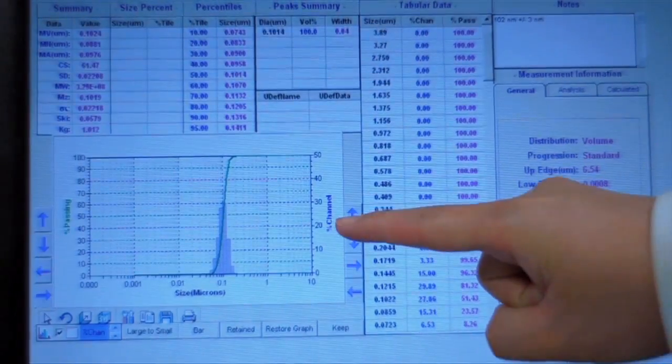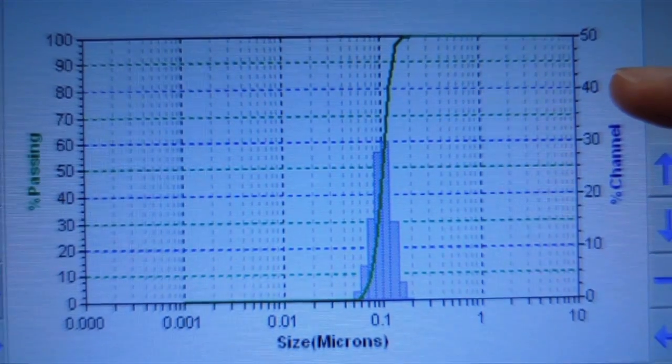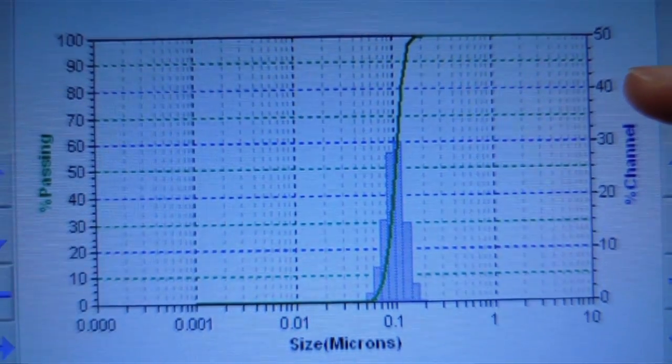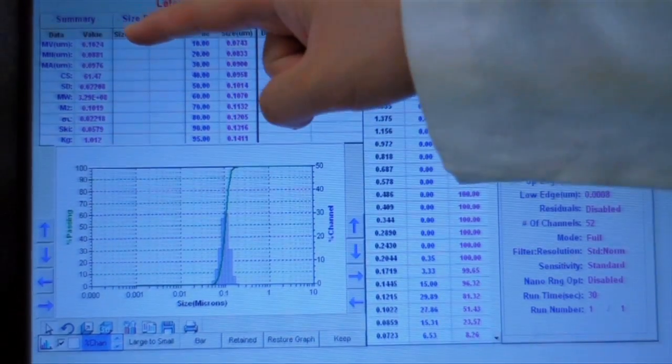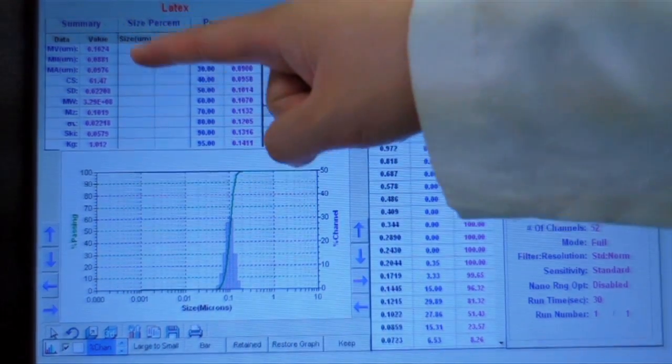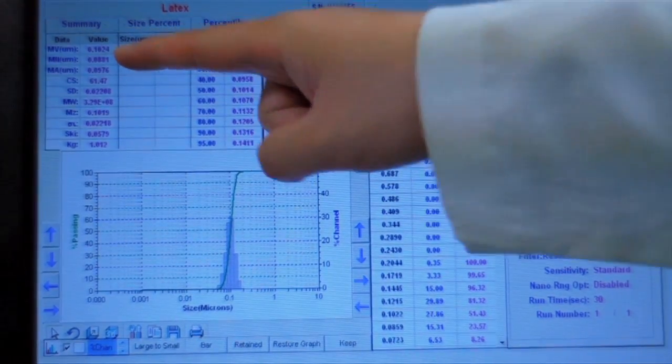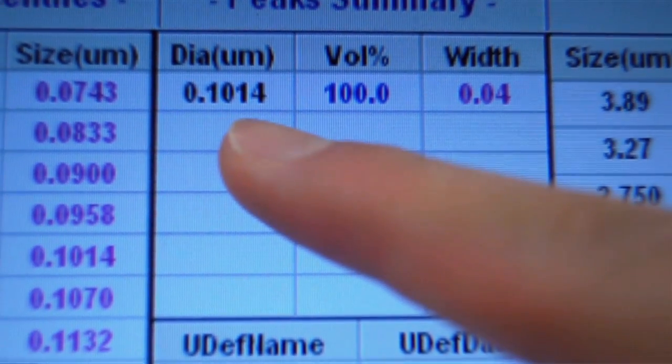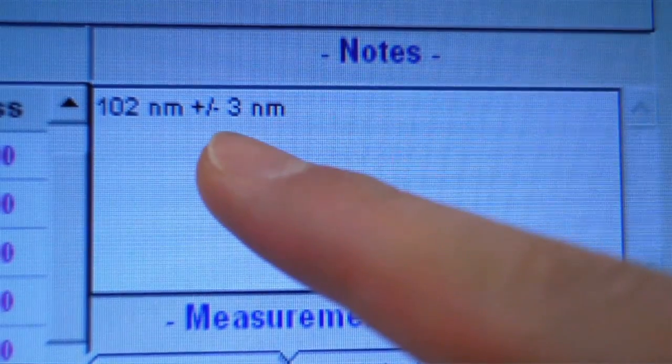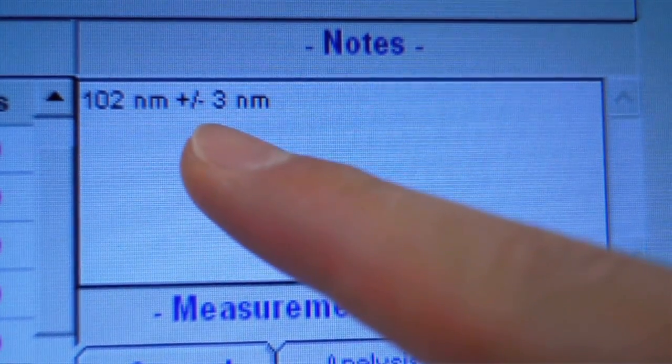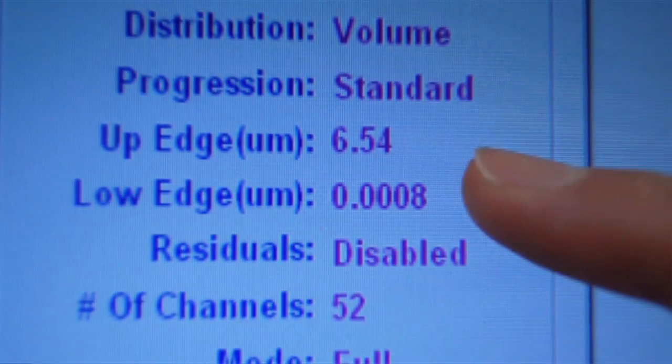Here is the data after the analysis. This is the size distribution curve, some statistical data on the samples, information on the peaks, some notes that we have added in, and the size range of the Nanotrack.